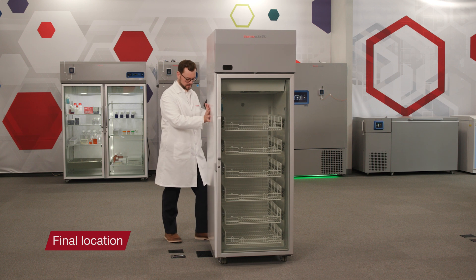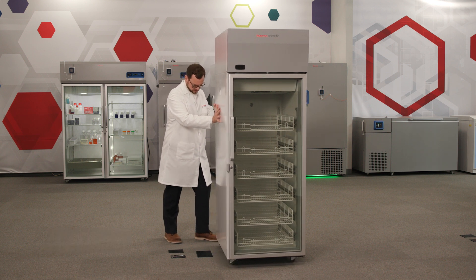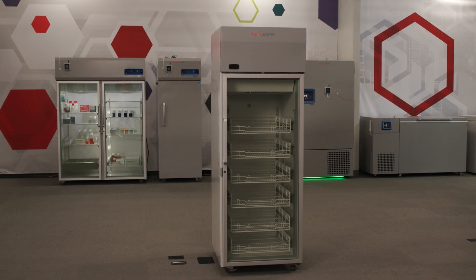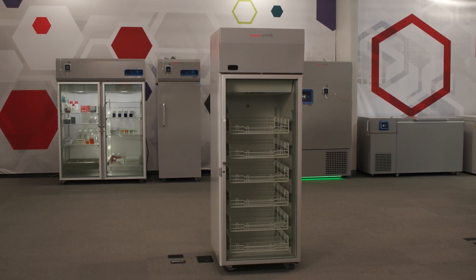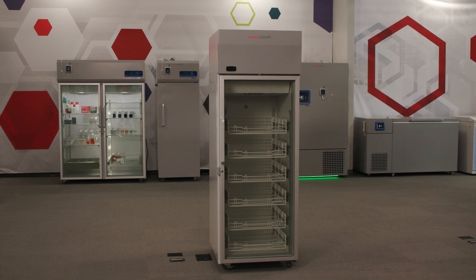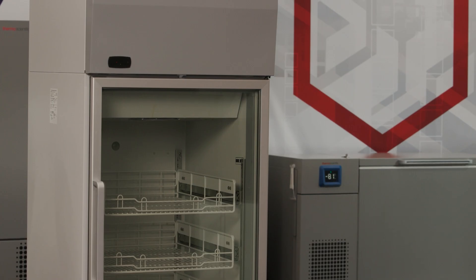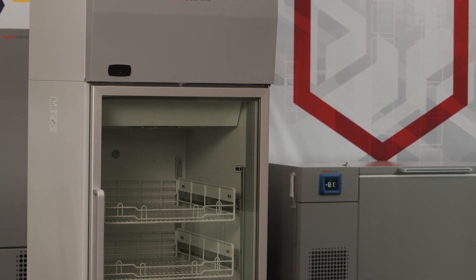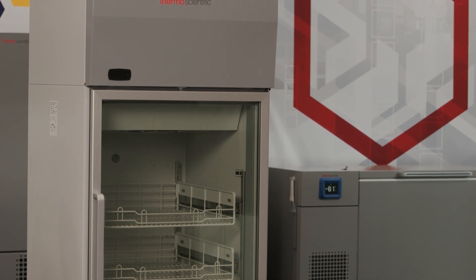Choose a location for the refrigerator that is both level and vibration-free. Allow at least 6 inches of open space in the back and on each side, and 12 inches of clearance above the unit for proper ventilation. Do not place the refrigerator in direct sunlight or near heating vents, radiators, diffusers, or other heat sources.